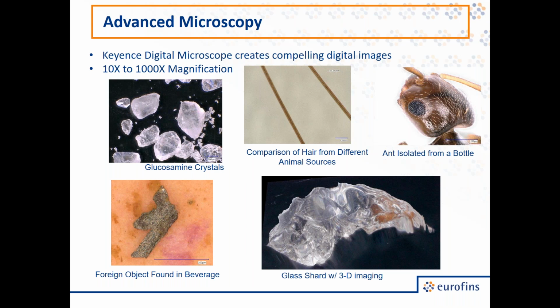For example, when we look at a residue that contains crystalline material, when we look at it under a microscope, we can often tell whether it looks like one material or whether there are multiple types of crystals. If there are multiple types of crystals, there are probably multiple things being present, and that suggests we could have multiple sources, and we need to analyze each of them separately, not combine them all into one mixed analysis.